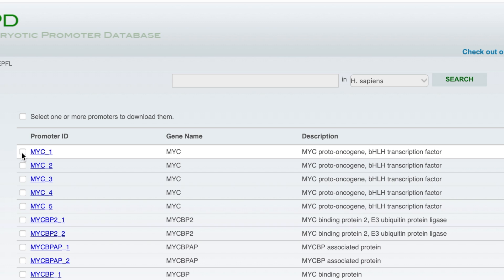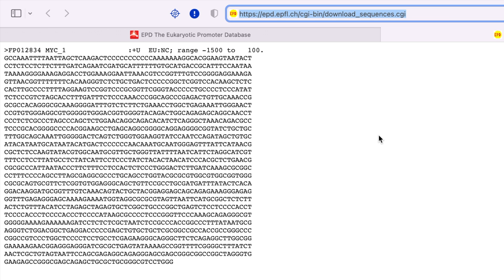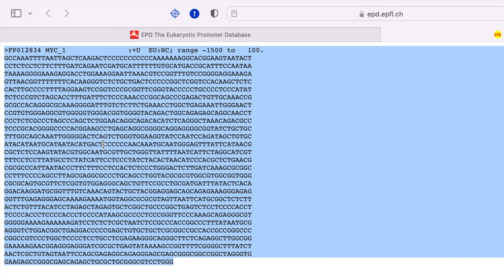Let us download the promoter sequence in the FASTA format from 1500 base pairs above the transcription start site, then click the download button. Here is the CMYC promoter sequence in FASTA format from minus 1500 to plus 100 base pairs from the transcription start site. Now copy the entire sequence and paste it in a word file.